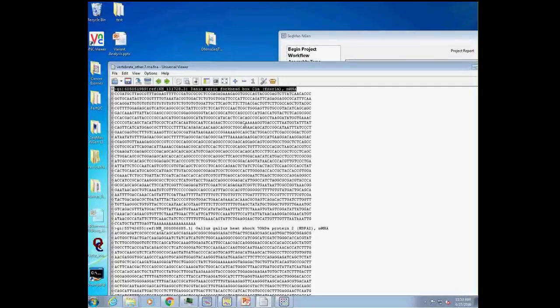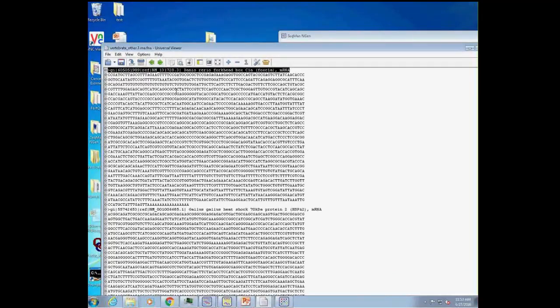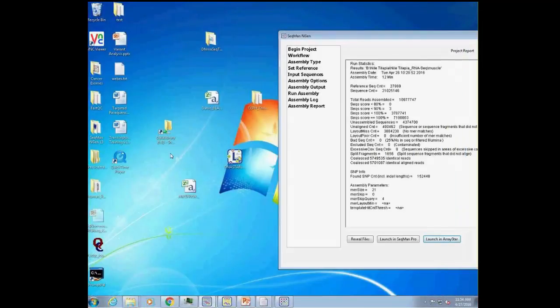And then the third option is what I showed today, and that's I'm going to use the newly created annotated contigs that I got from my de novo assembly. So what I showed earlier was loading in a .transcriptome output package from a de novo assembly. And our software looks inside that package and uses both the identified transcripts and the novel as reference sequences. So it's using those consensus sequences for each one of those assembled transcripts.